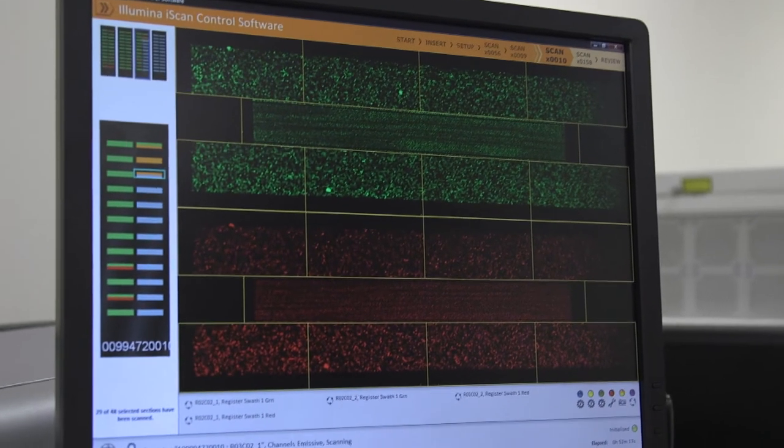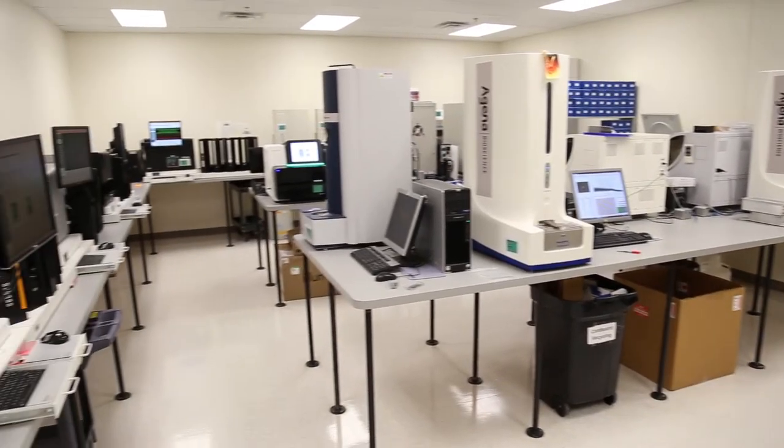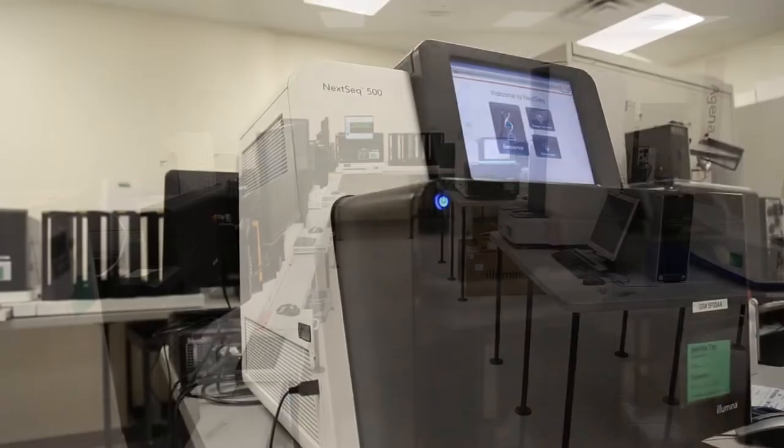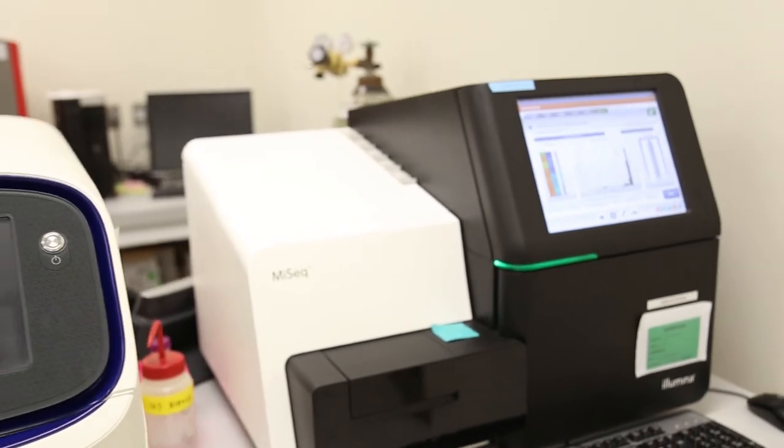By seeing this data, we can analyze the animal's genetic data for meaningful patterns. These steps rely on some of the most advanced technologies in the world, including those that scientists use to study personalized cancer care in humans.